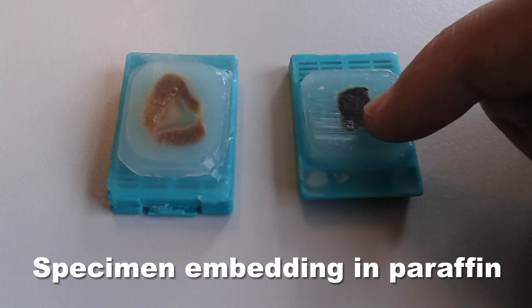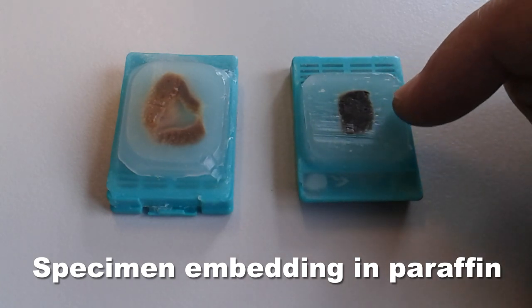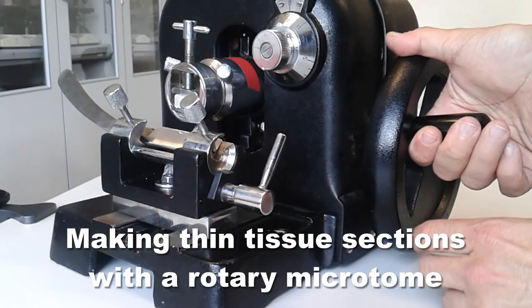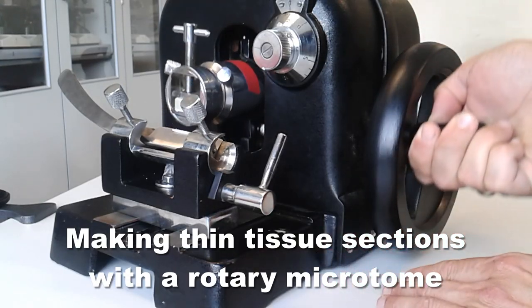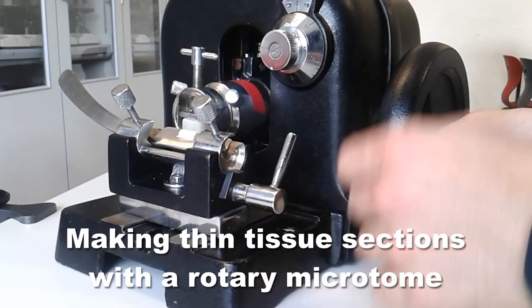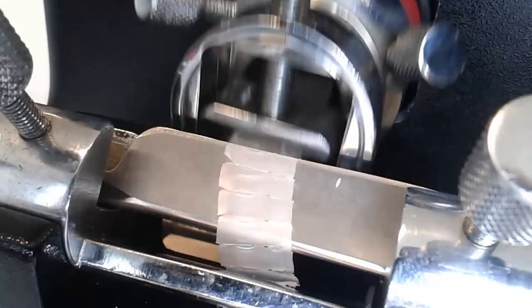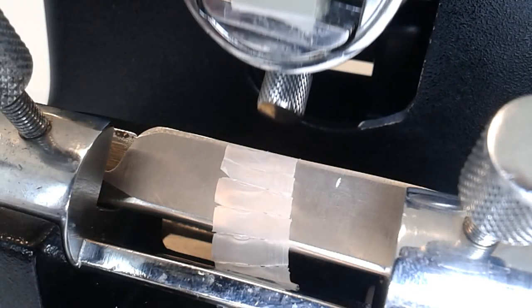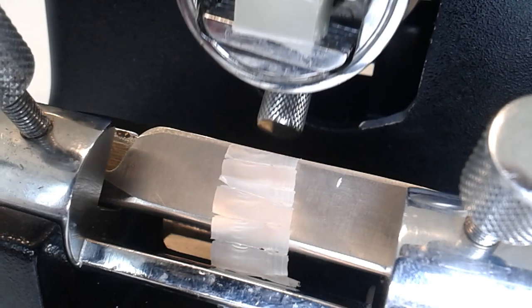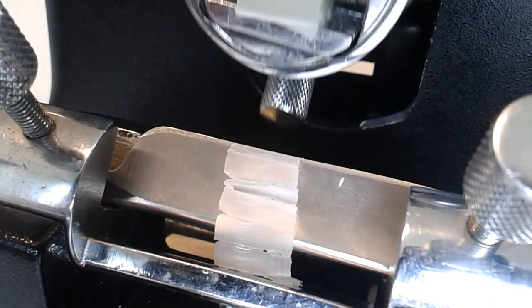However, this is a very lengthy process. The whole preparation process takes several days because you have to dehydrate it using an alcohol series. And also the microtome process is quite a lengthy and delicate process. So it's not very suitable for amateur microscopy use but hospitals and research organizations they usually do that. So this is one of the problems that I have to overcome.